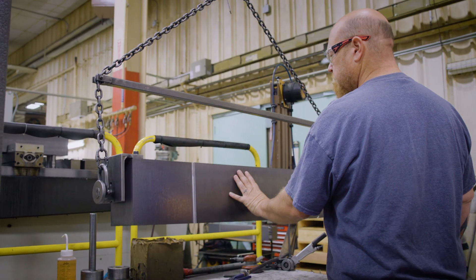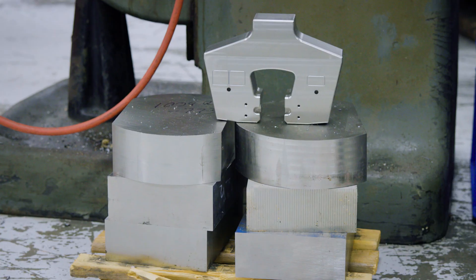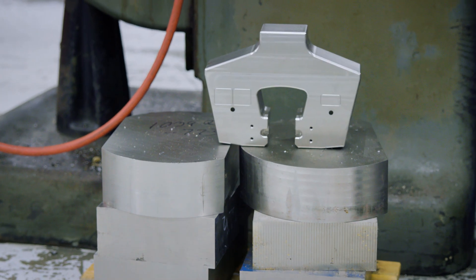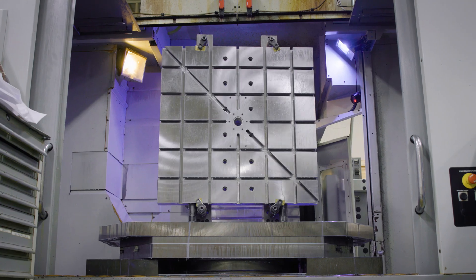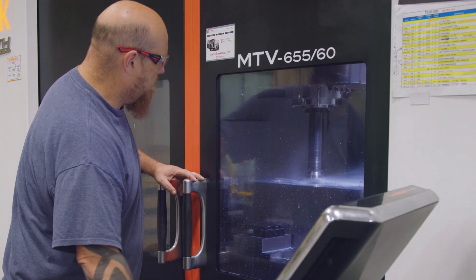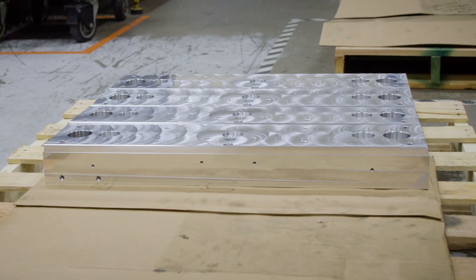It all starts with the material. We source only the highest quality metal alloys to create our best-in-class products. Using advanced machine tools, we manufacture critical frame components like crossheads and base beams for our 3400 and 6800 series universal testing systems.